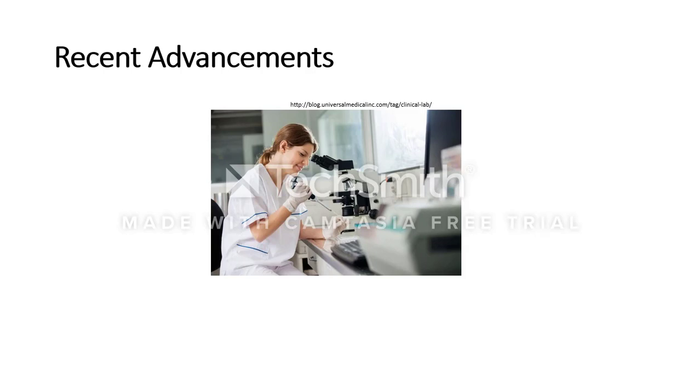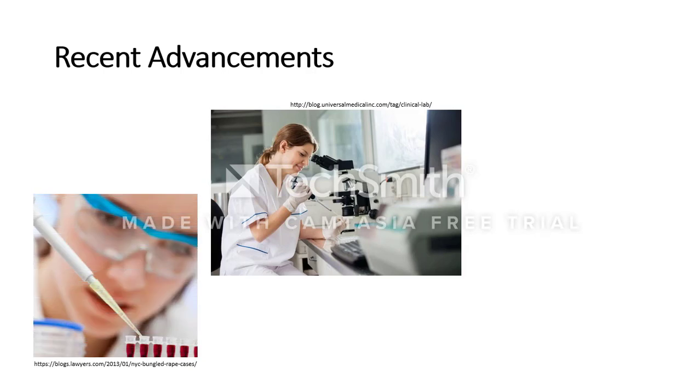An approach known as SELFIE qPCR was recently created in which no reference gene or housekeeping gene is required. Instead, a comparable absolute digital expression level will be generated to share between all of the labs, thus eliminating the need for multiple reference genes.